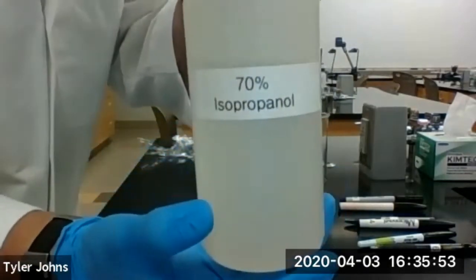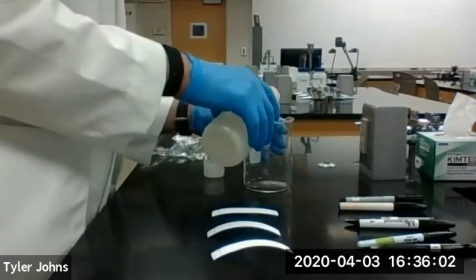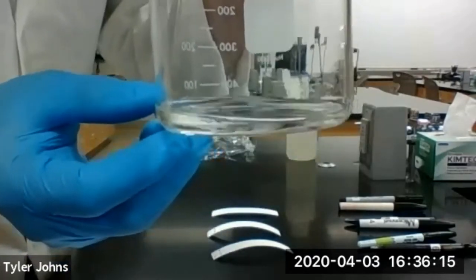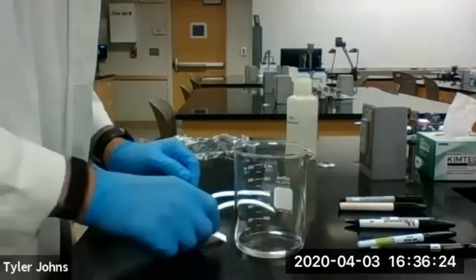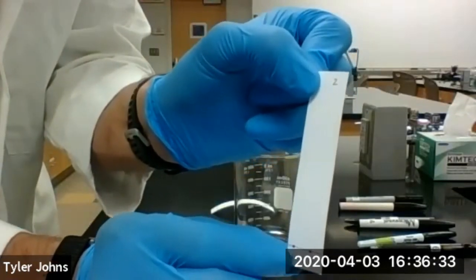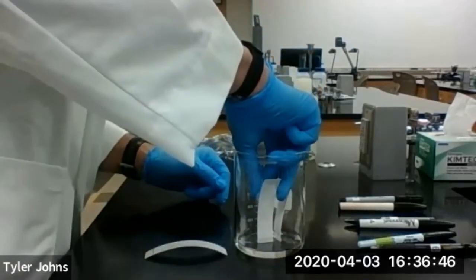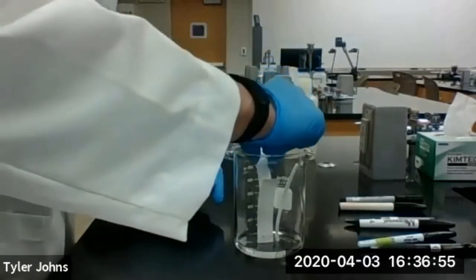Our solvent is going to be 70% isopropanol. We're going to add this to the bottom, just to cover the bottom of a 600 ml beaker. You can see it's just covering the bottom of the 600 ml beaker. Then we're going to add our chromatography paper — this is the bottom — and that's going to sit and rest in the beaker. We can run all of these in one chromatography chamber, which is the beaker.